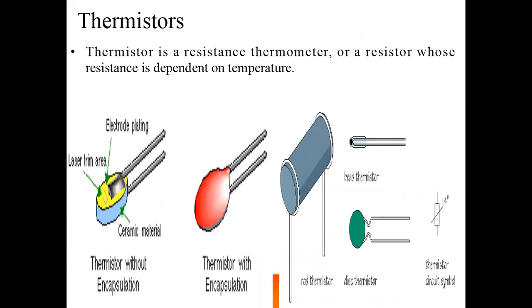Thermistors. A thermistor is a resistance thermometer, or a resistor whose resistance is dependent on the temperature. And these are the different kinds of thermistors that are used in the market.